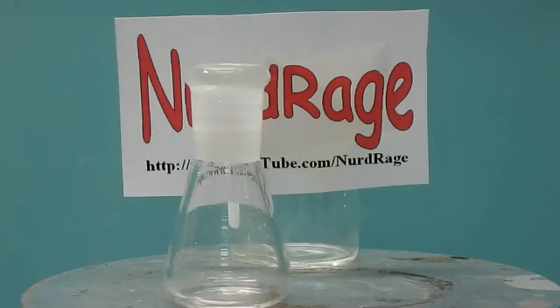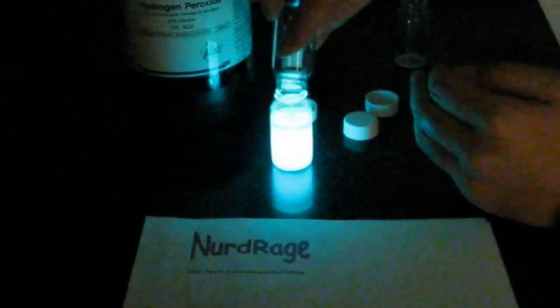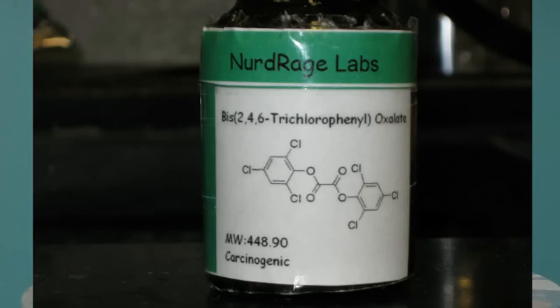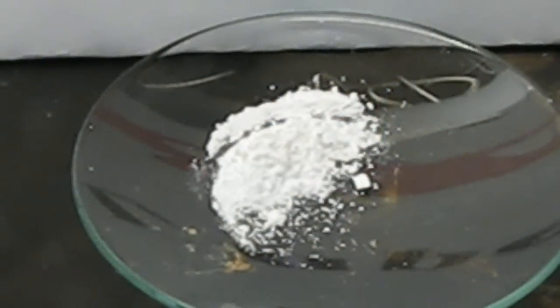Greetings fellow nerds. So far we've made a lot of videos on glow sticks and have always used the key ingredient of TCPO, or bis-2,4,6-trichlorophenyl oxalate. As promised, in this video we're finally going to show you how to make it.